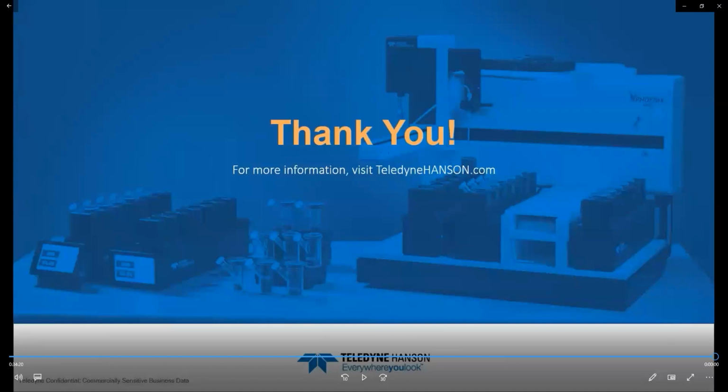Perfect. Next question is about sink conditions. So how do you check sink conditions? Yeah, it is absolutely necessary to check the sink condition before doing the IVPT. I didn't mention these conditions in the webinar, but in the first webinar, I think I mentioned that you should check for sink condition.